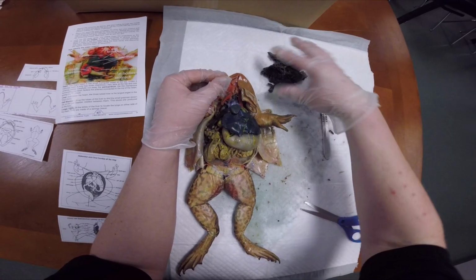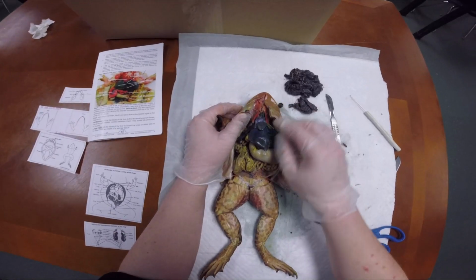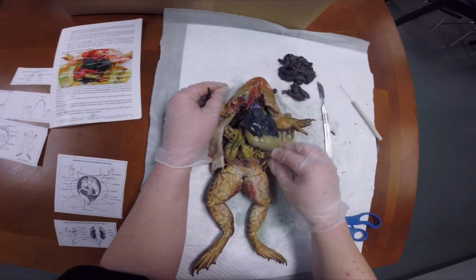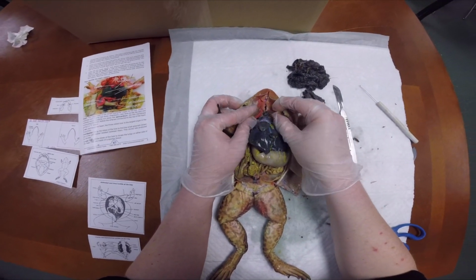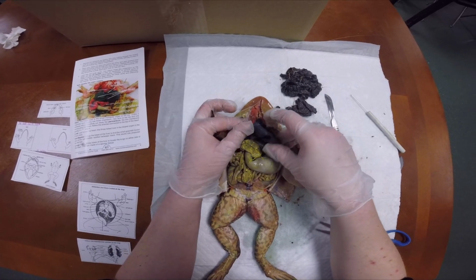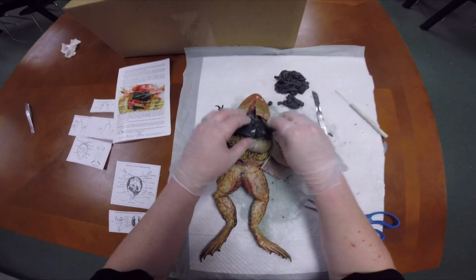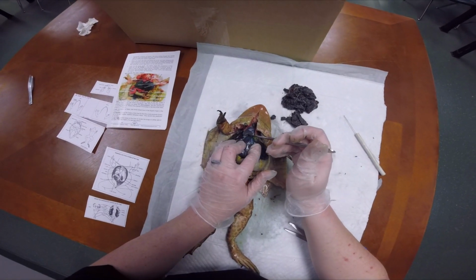So let's get to the big stuff. I'm going to move all those eggs out of the way so we can kind of see what we're doing here. All right, so this is where the money is. We're going to identify this big blue thing right here as the liver. You can see it takes up a lot of space, kind of like ours does.